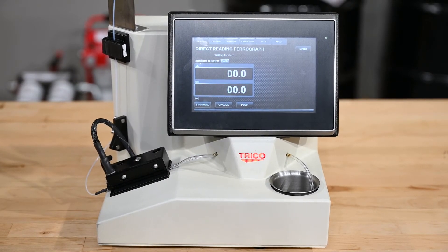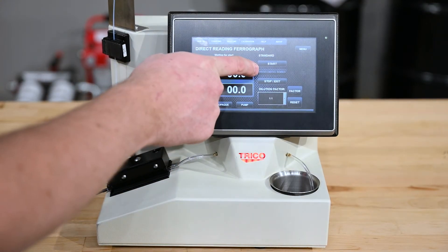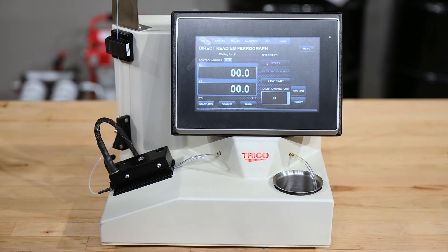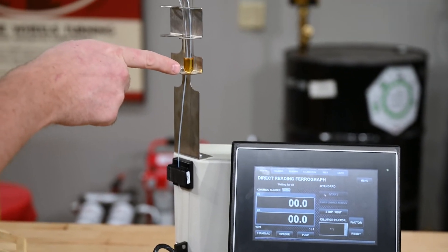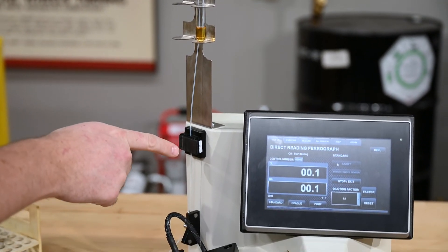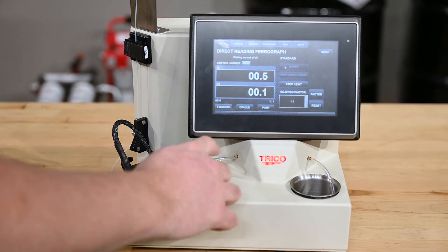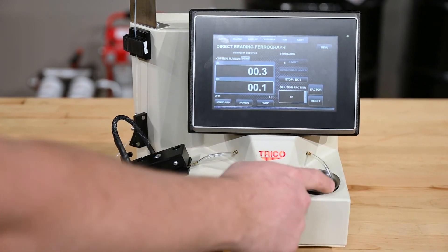Now when we're ready to run the sample we're at the home screen. We press standard, and if you need to enter a control number it'll prompt you for it, otherwise you press start. The unit then pumps and pulls the oil from the oil sample up the tube, down through the end of oil sensor, through the tube holder, over the magnet assembly, then into the peristaltic pump, and out through the waste into the waste beaker.